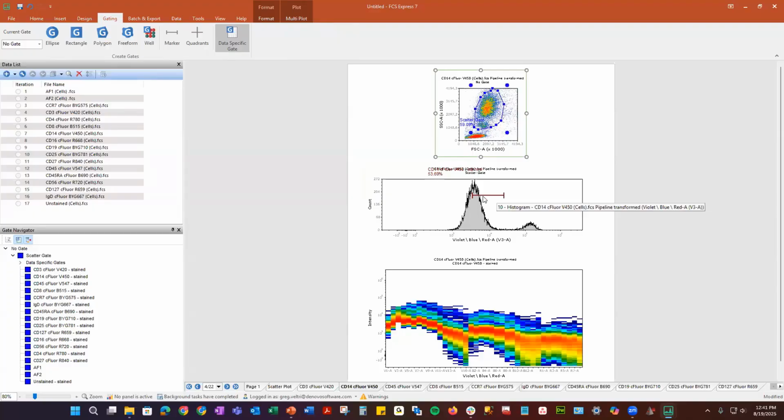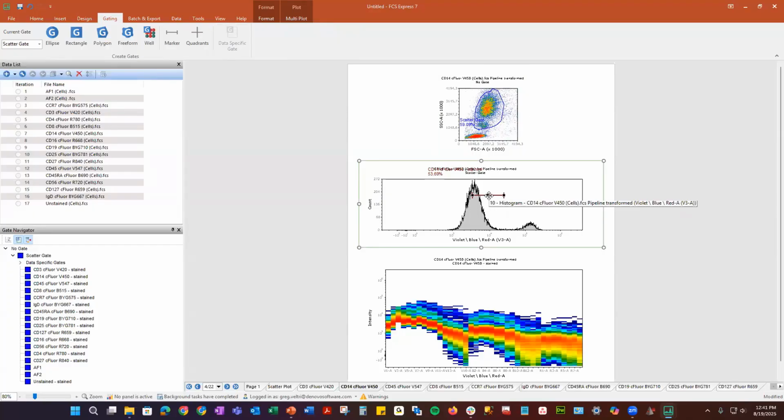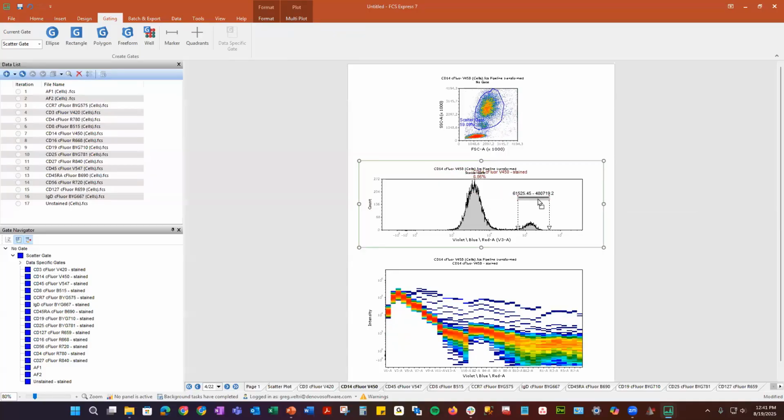And really, that was a negative autofluorescence area. And let's move this over here. And now I can also see on my spectral curve that I do have that. And it goes on and on, all the different ones.